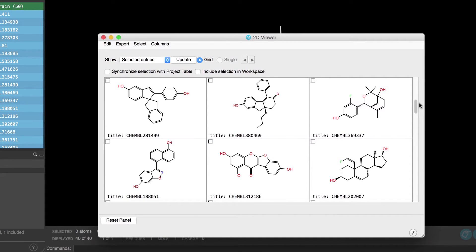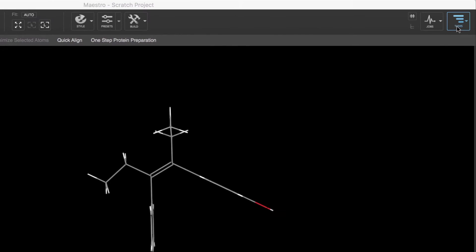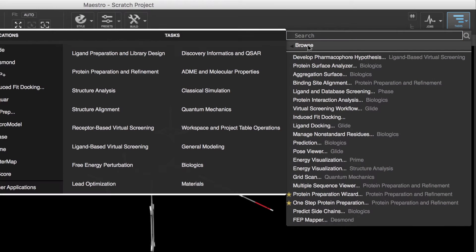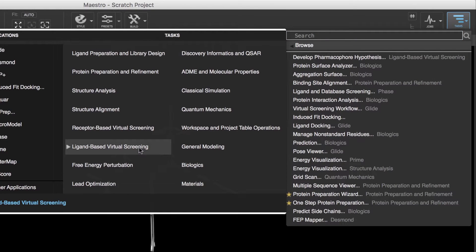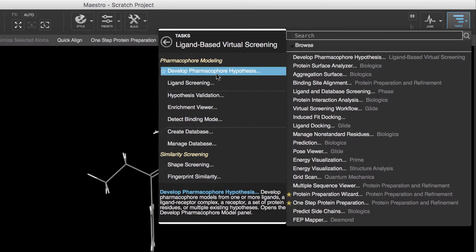Next we'll open the develop pharmacophore panel by going to tasks, browse, ligand-based virtual screening and then develop pharmacophore hypothesis.